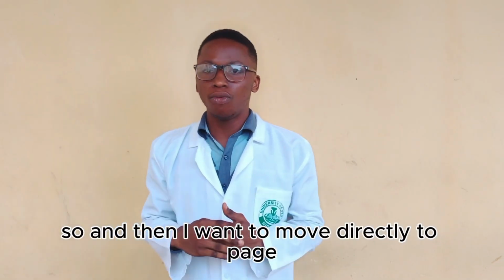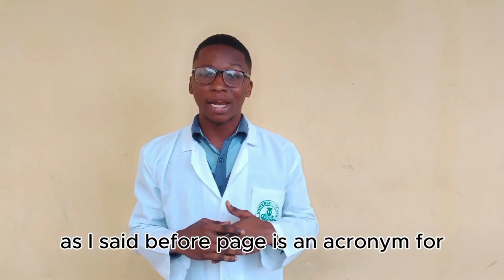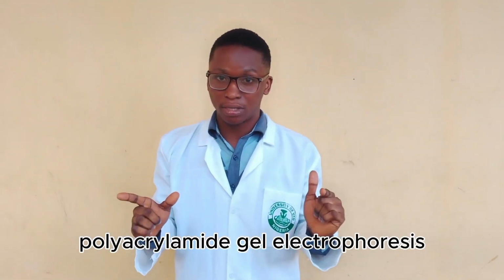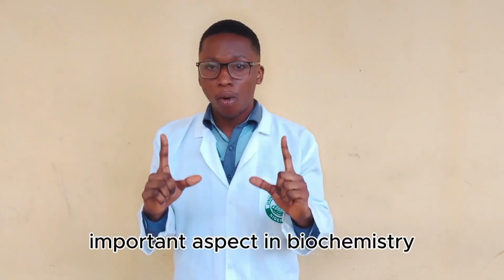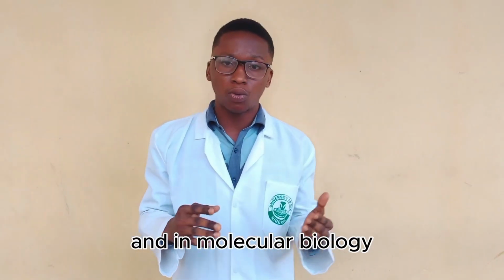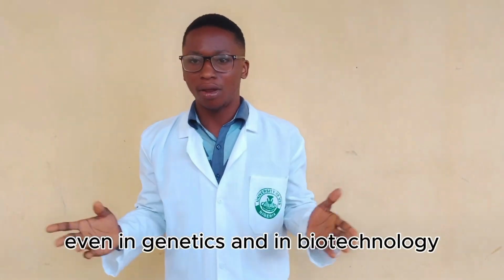And then I want to move directly to PAGE. As I said before, PAGE is an acronym for Polyacrylamide Gel Electrophoresis, and it is an important aspect in biochemistry and in molecular biology, even in genetics and in biotechnology.